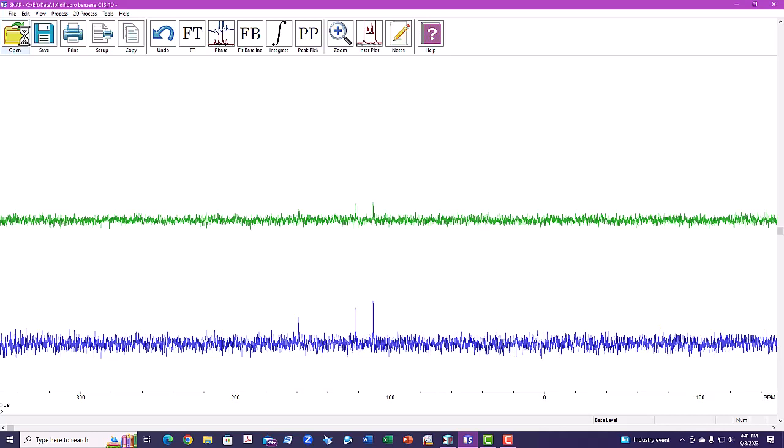Notice that the signal is increasing rather dramatically, so it looks like not only do we have those peaks at 110 and 122, there's another peak coming in out here. And this is what you'd expect from 1,4-difluorobenzene. The carbons with fluorines directly attached will be decoupled, but the carbons right next to them will not be. They each have a proton attached, so they'll be split into a doublet, and there's 4 of those.